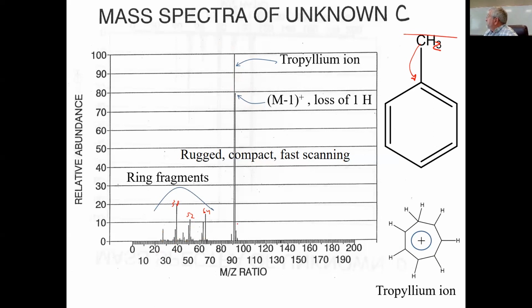That's about it. Now you can look down here and you can see that this is the molecular ion peak right here, and you have some isotope peaks. If that's 80, and this is about 5, so if you convert this to 100, this would be about 25% bigger, about 6.25 or something like that.